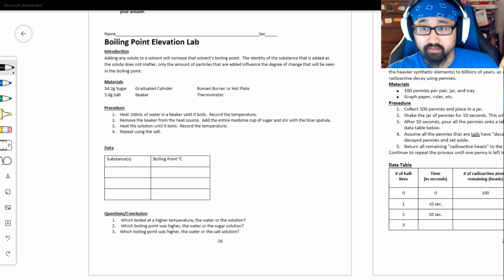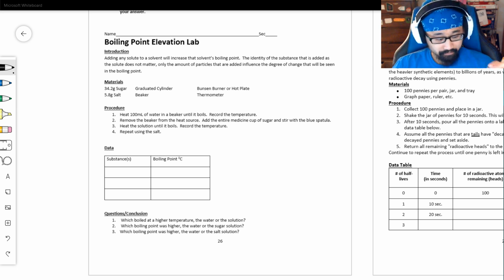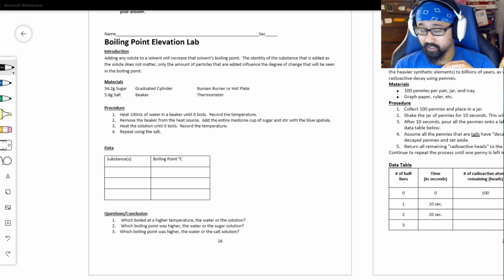Also, please check my CBA, just as a generic statement, and make sure that everything is in. This lab is a boiling point elevation lab. It's based on a concept we haven't exactly talked about. Fully remote students might have already watched the notes for boiling point elevation because they're in solutions, but anyone who is in class normally wouldn't have this yet. But I'm going to use it to intro why boiling point elevation happens.